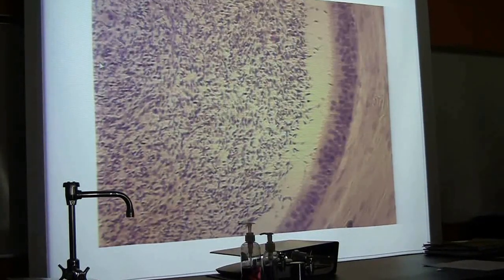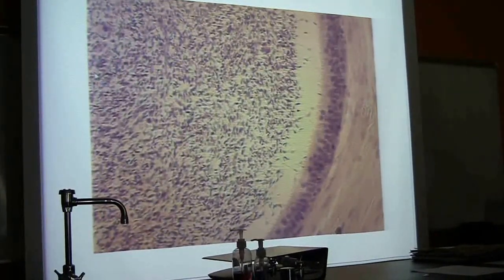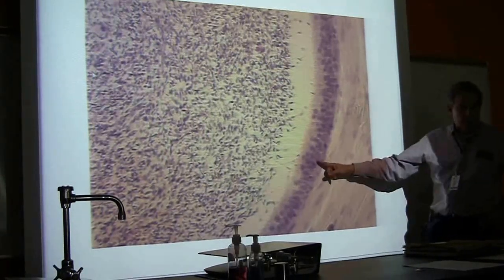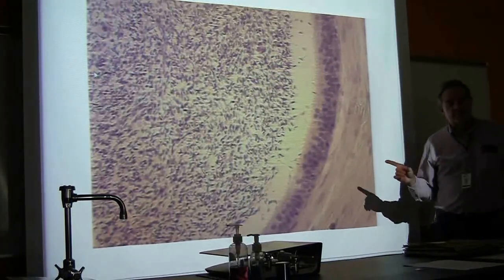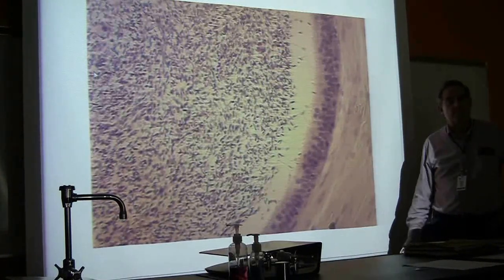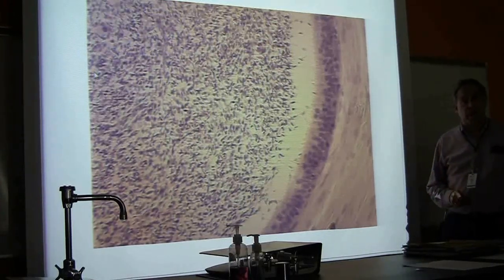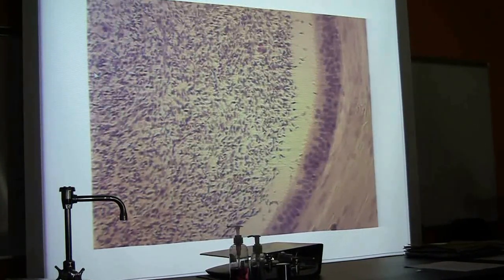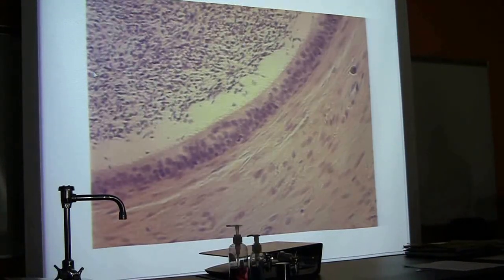Now, if we look at the lining, the epithelium that lines the wall of these tubes in the epididymis, you should know the type of epithelium looks much like we saw in the trachea, but not quite. Like the tracheal lining, it was what kind of cells? Pseudostratified columnar. But unlike the trachea, which had ciliated pseudostratified columnar epithelium, this, even though it appears to be ciliated, is not. What we see here that appear to be cilia are actually what are called stereocilia, and they're really microvilli.